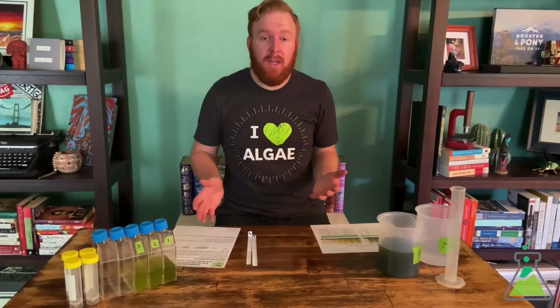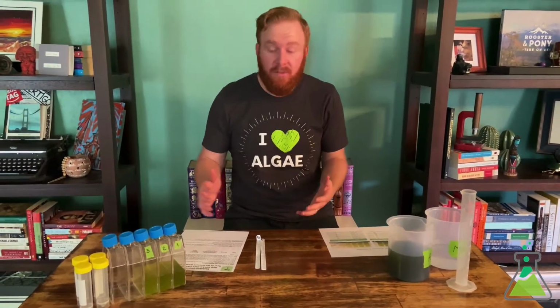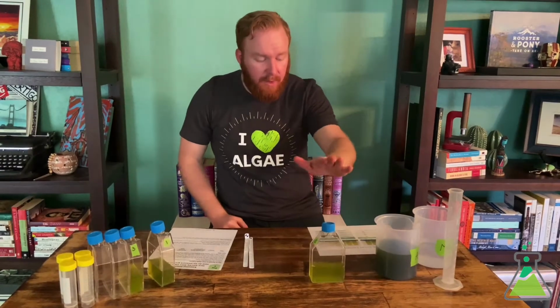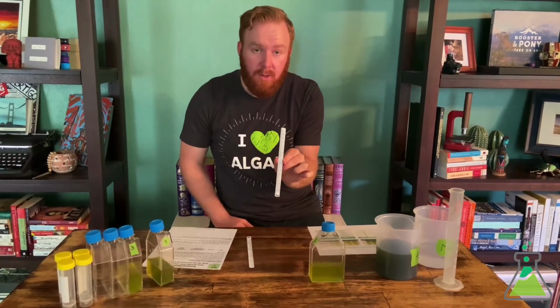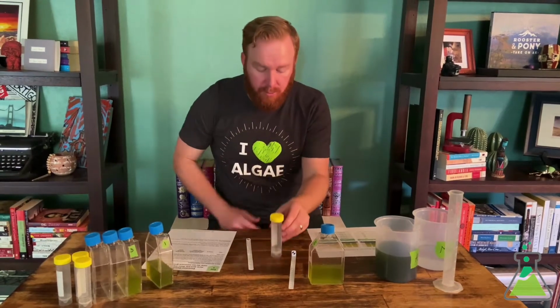Hey everyone, so we just got done setting up our algae cultures. So the next step is to figure out how much algae we actually have in the culture. And so group 2 here is your flask we set up just a few minutes ago. So set that here. And to figure out how much biomass is in here, we are going to use a couple of different tools. So we have the Secchi stick, which we'll talk about how to use here in a moment. And then we also will use our 50 milliliter skirted falcon tube.